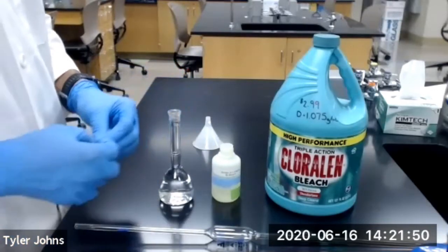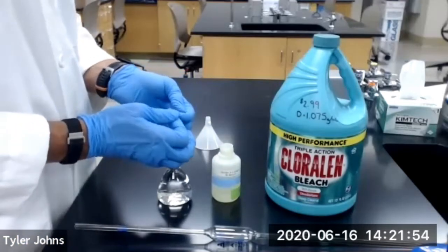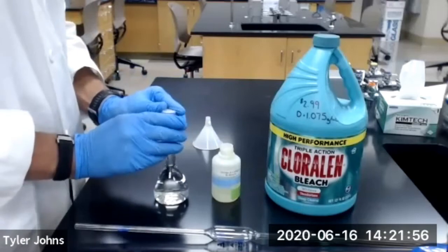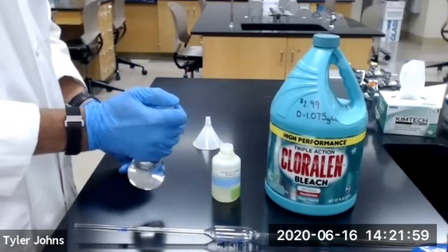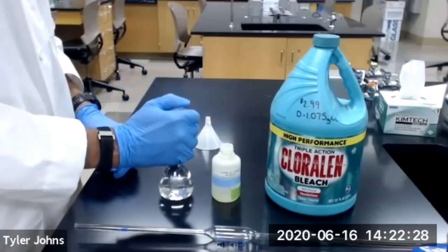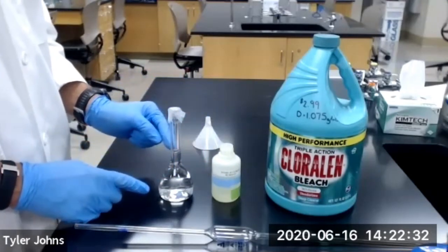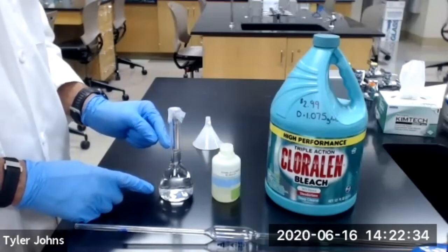Now we're going to cover our 100 milliliter volumetric flask with parafilm, and we will invert to mix. This is the diluted bleach solution that we will be using.